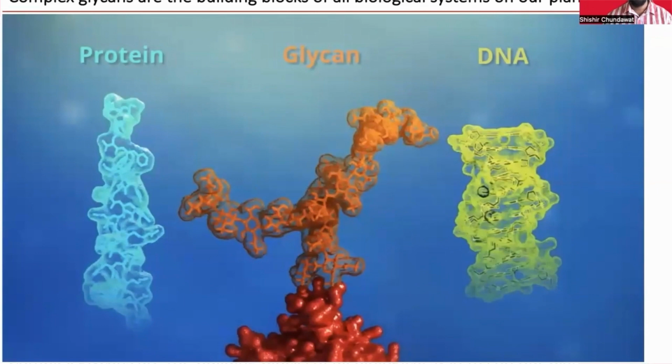So with that, Áron's going to take over now. Yes, so thank you, Dr. Chundawat, for the introduction. So I will be talking about the N-GLYcanyzer system. But before we talk about that, we need to talk about bioprocessing, biomanufacturing. So what we'll be talking about mostly here will be on monoclonal antibodies. So this is a typical monoclonal antibody, and they're used in combination with immunotherapies.